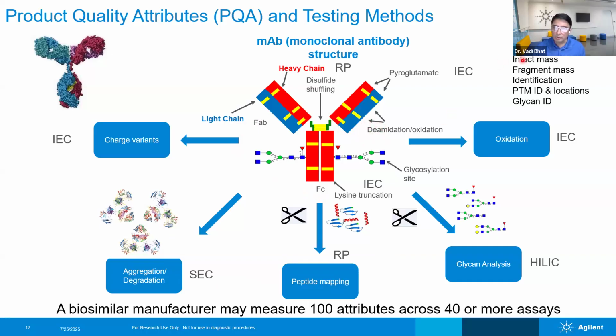Now all of them can be analyzed in the LC mass spectrometer. From the simplest mass spectrometer, like single quad mass spec, which is low resolution, to really high resolution mass specs, and in between, mid range, time of flight mass specs also come into the picture, simple time of flight instead of the hybrid instruments.